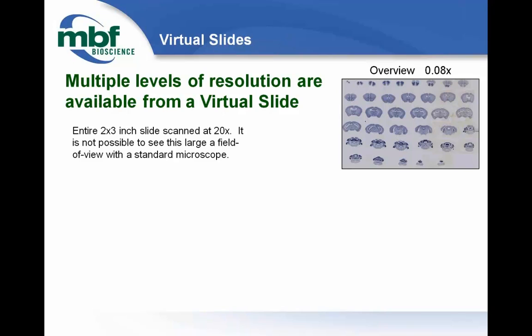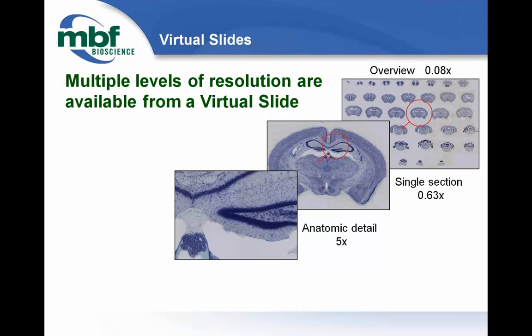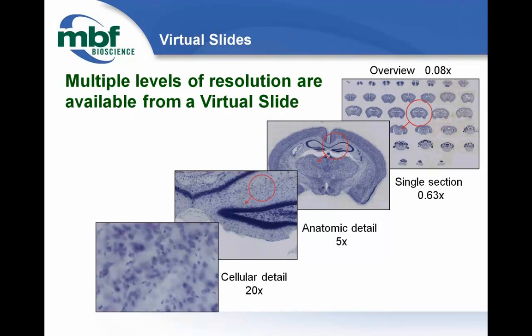So while what we're demonstrating today can be done live on a microscope system, we'll be working with virtual slides. And for those that are unfamiliar with the term, virtual slides are images containing multiple fields of view that have been stitched together to enable large areas of interest to be stored in one digital image. The images we're using today are comprised of hundreds, if not thousands, of individual fields of view, which means we're using gigabytes worth of pixel data. So virtual slides enable users to share information easily, as well as work away from the microscope when necessary.